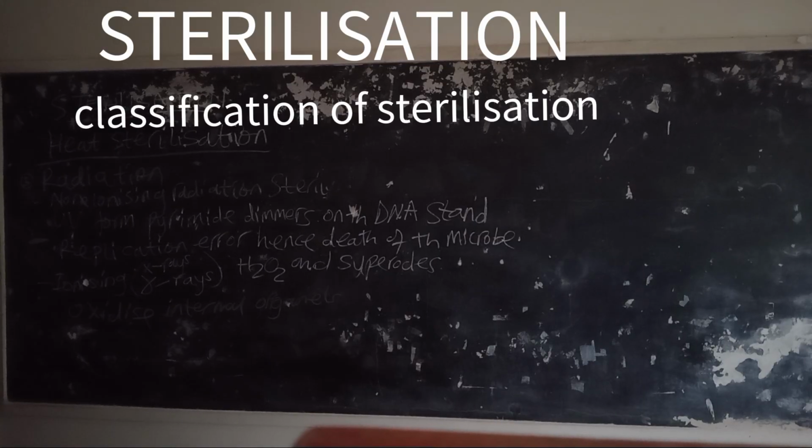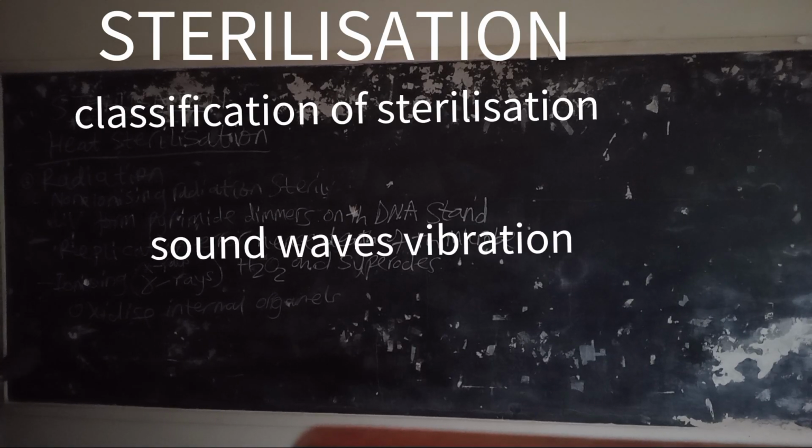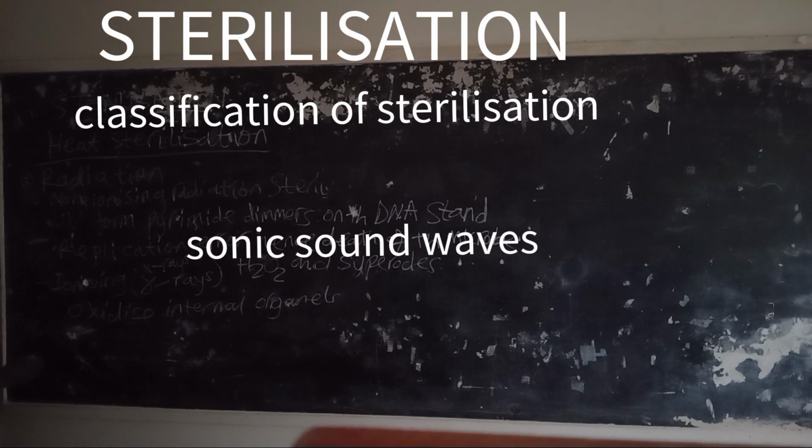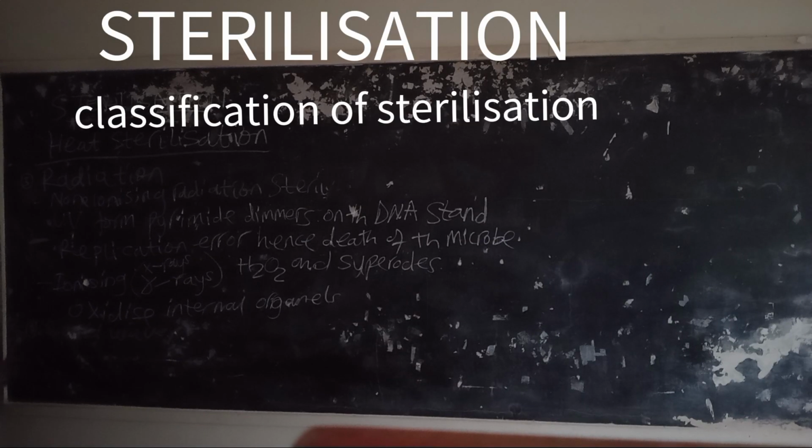We have another one, where we use sound waves. Here we use sonic waves in liquids, and they create cavities, which later collapse to kill the microorganisms present in the liquid.